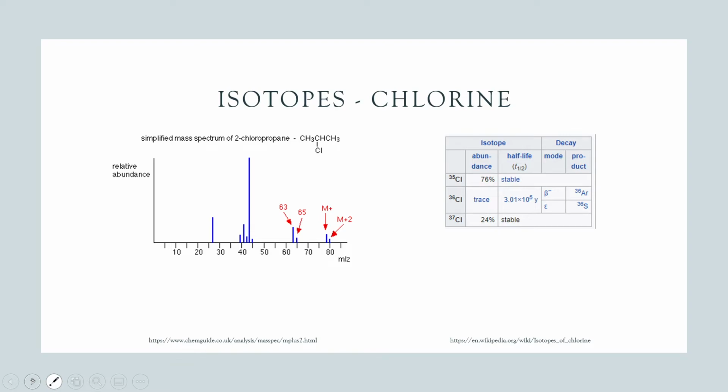However, in mass spectroscopy, it's not so helpful, because the mass spectrometer itself is able to distinguish. It doesn't take measurements of individual molecules and just take their average mass. It doesn't know that particular types of isotopes exist for different elements in differing abundances. It just takes measurements of things by the mass that every individual particle is. So what that ends up meaning is that we have pairs of peaks, like we see for chlorine here.